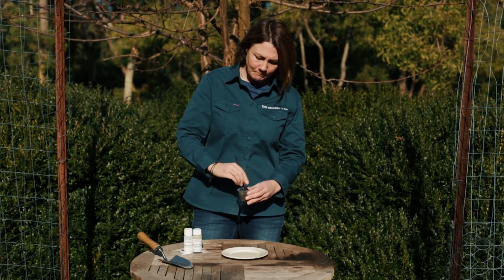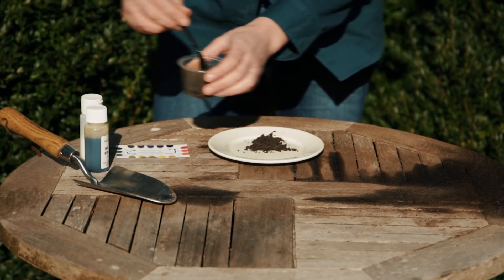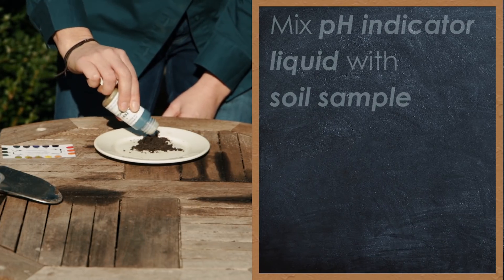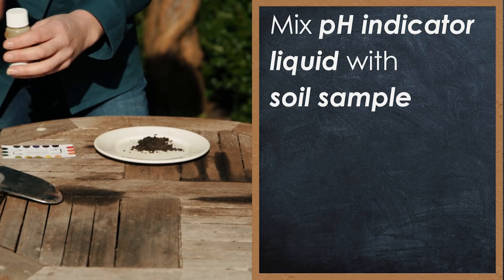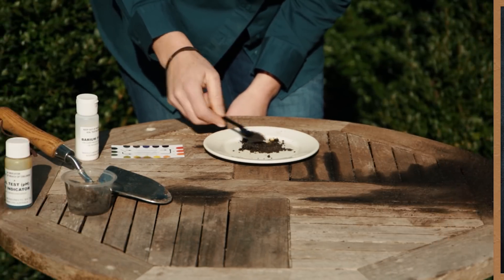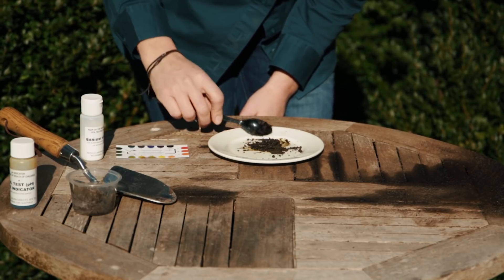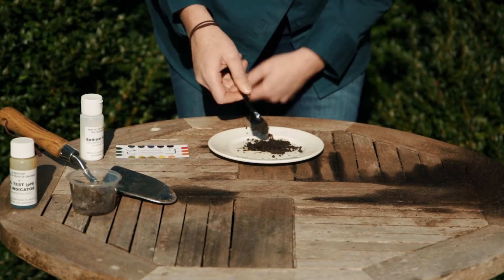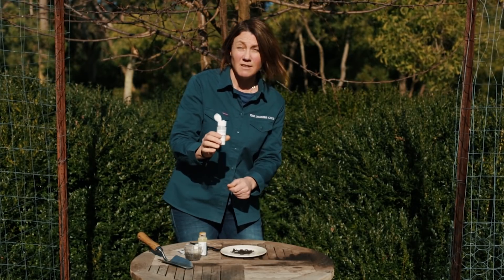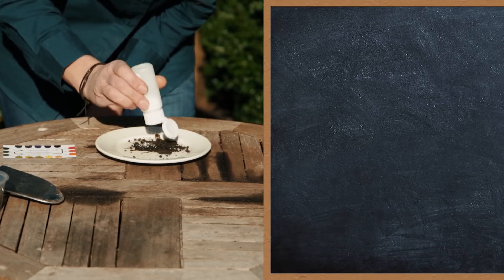Once that's mixed up, you simply put a teaspoon on a white plate to make it easier to see, and you use the pH test indicator liquid. Put a few drops on to make it into a bit of a paste and mix it up — nice and moist like that. Then you get the barium sulphate, which is like a white powder, and this will change color to indicate exactly what the pH of your soil is.